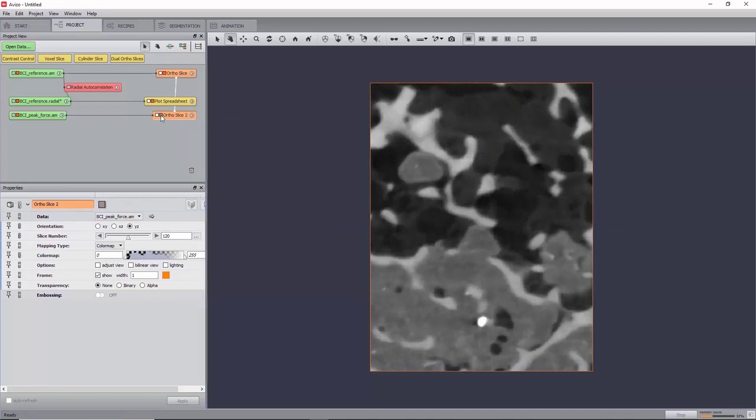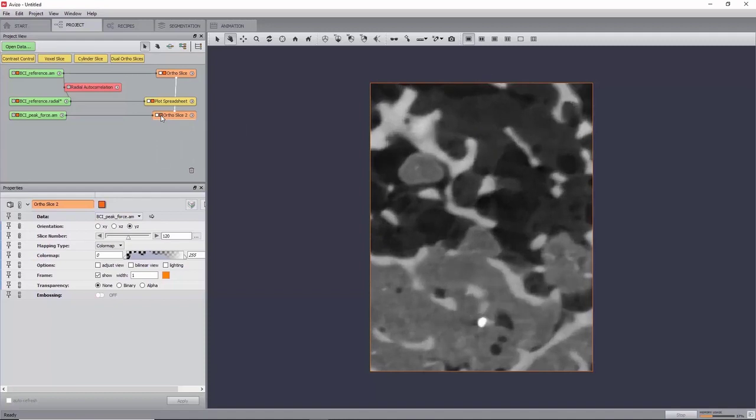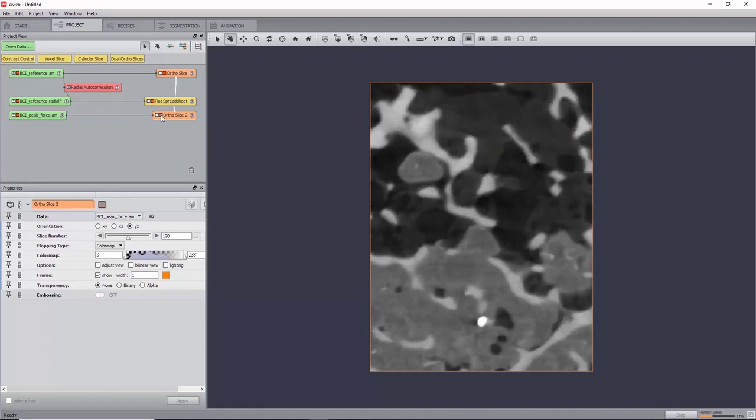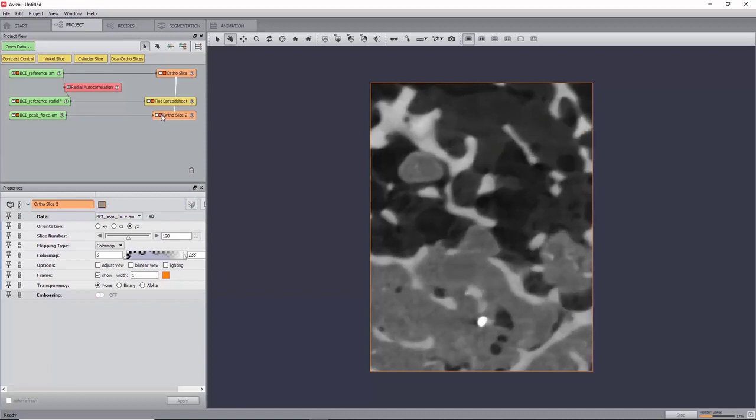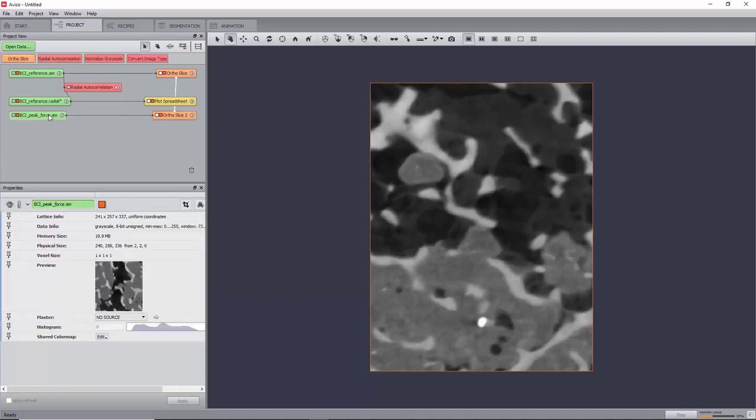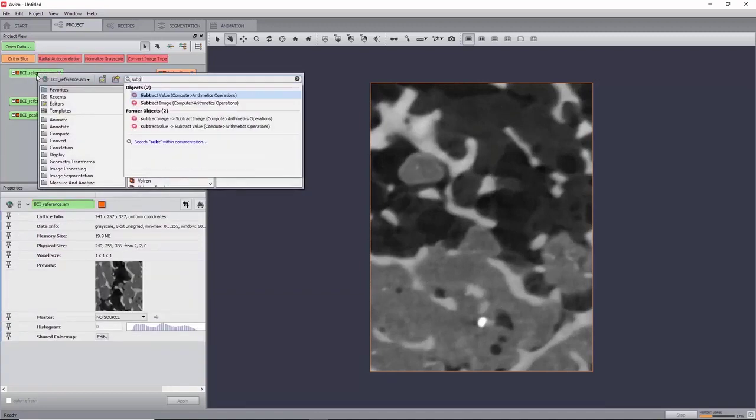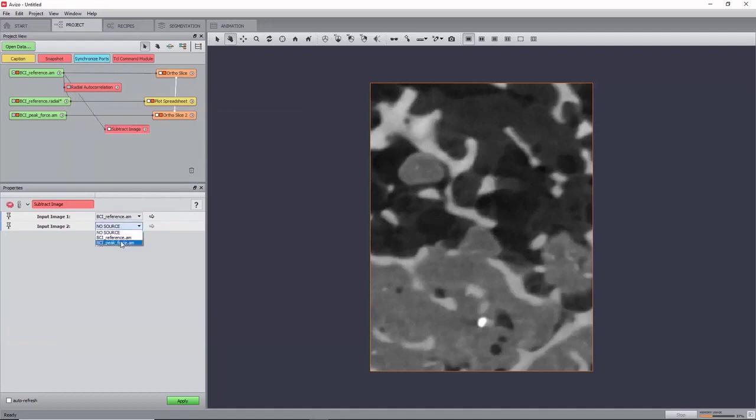By turning this second autoslice on and off successively, we can observe the deformation that happened between the two images. In order to estimate the maximum displacement in this image, and because the images have been pre-aligned, we can just subtract one by the other using a subtract image module. Create it on the reference image and select the deformed image as input 2. Now click Apply.